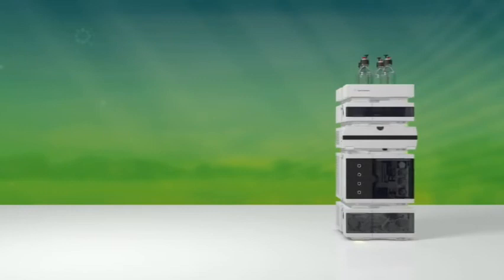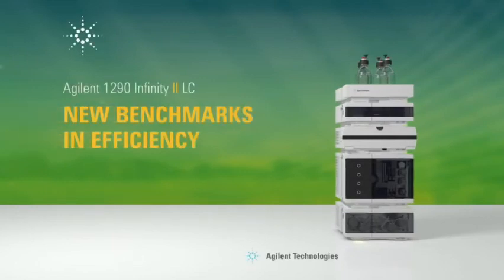The Agilent 1290 Infinity 2 LC, setting new benchmarks in efficiency for the next generation.